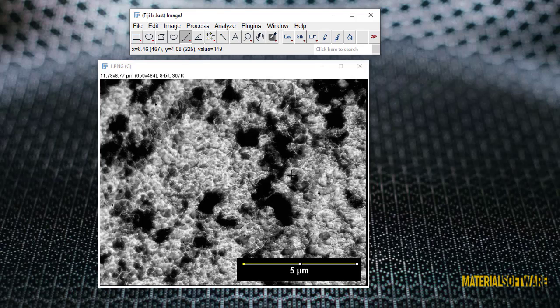Finally, we press the OK option. Now our image is calibrated in the software, and you can perform the required analysis with the software, which I will teach you in the next parts of the series.